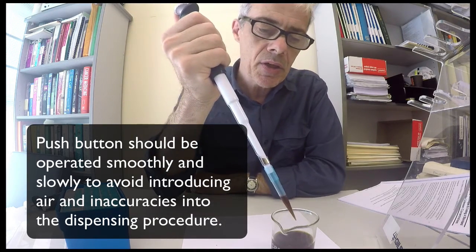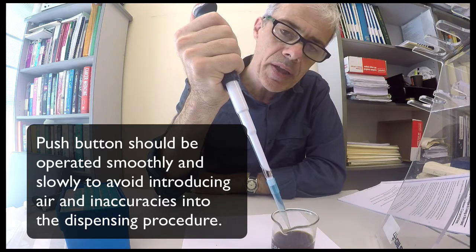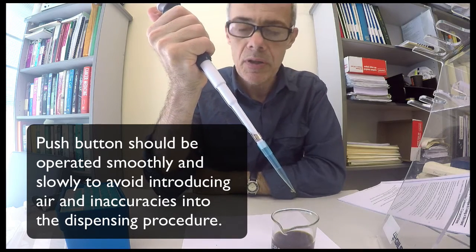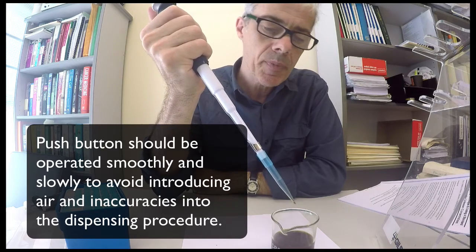To dispense, you go back down to the calibrated stop and then just down to blow out that extra bit of air, put a bit more pressure on it.